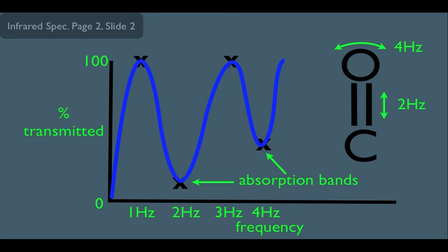For instance, it's safe to assume that if the carbon were singly bonded to the oxygen, remember, single bonds are longer than double bonds, so you can think of that single bond as being a different type of quote-unquote spring than the double bond. Which means if your molecule had a C singly bonded to an oxygen, that bond would stretch and wag at different frequencies than the C double bonded to the O, and would therefore have its own unique absorption bands. So notice what the IR helps us figure out. It simply helps us determine what functional groups might be present in a molecule.